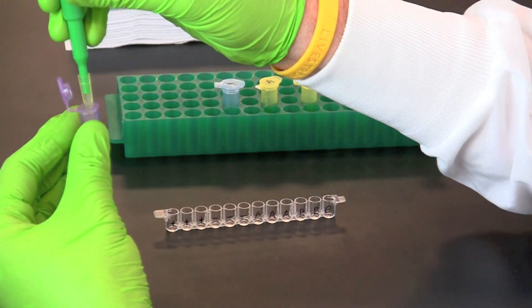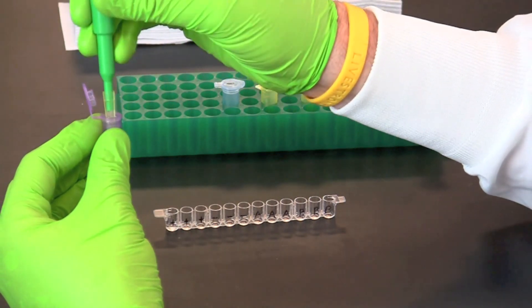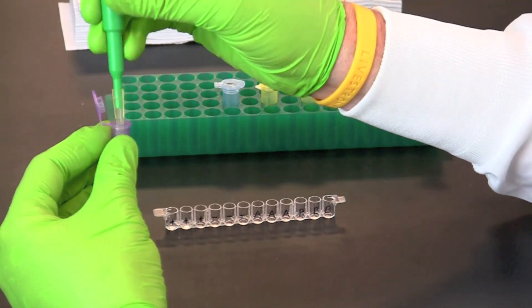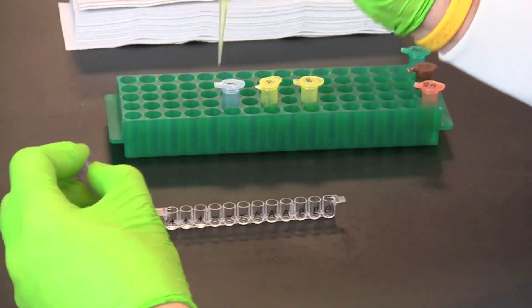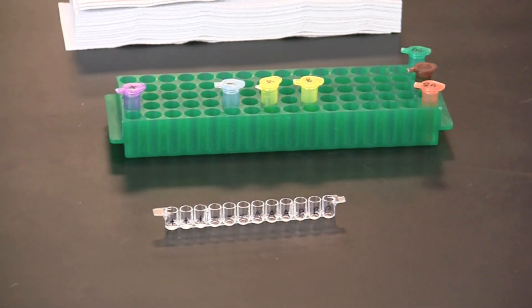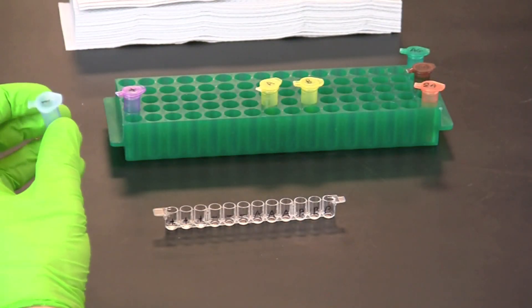Use a fresh pipette tip to transfer 50 microliters of the positive control into the three wells labeled plus. Use a fresh pipette tip to transfer 50 microliters of the negative control into the three wells labeled minus.